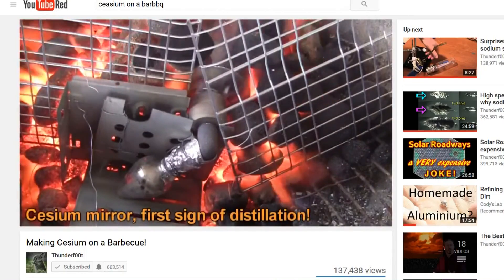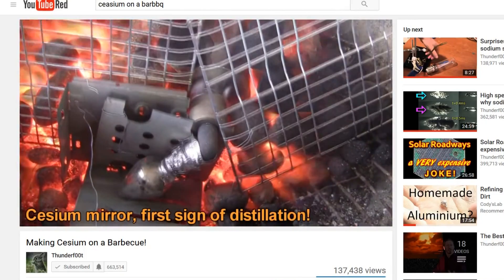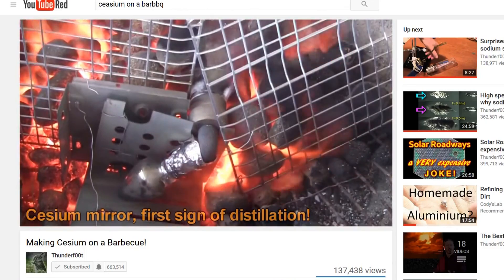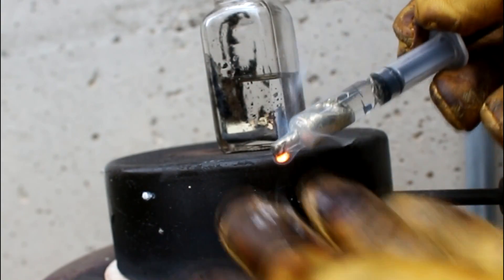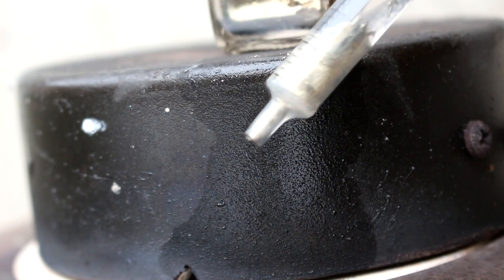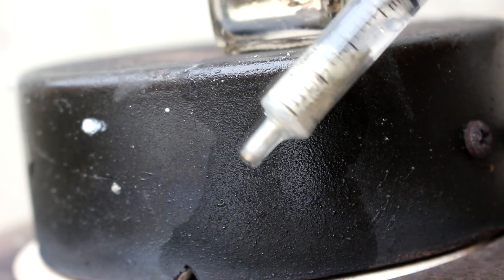I'm not the first YouTuber to do this. In fact, Thunderfoot has also made a video about making cesium using a very similar method to what I did here. I'd recommend going to check him out if you're into the science videos. But I'm going to take this now and I'm going to go seal it inside of a glass tube so that I can keep it for later.